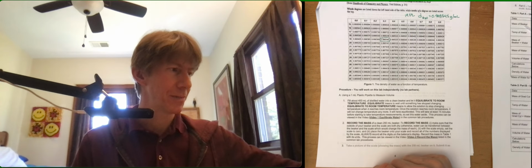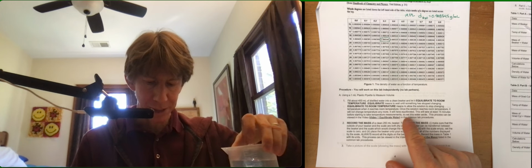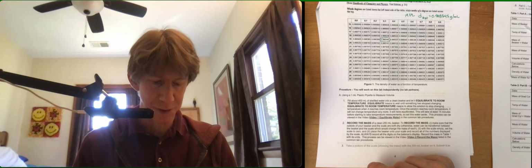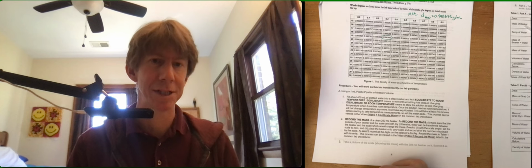And to change temperature when it reaches room temperature. This will take at least 15 minutes before starting to take temperature measurements, so set this water aside. This process can be viewed in the video and in the common lab procedures.